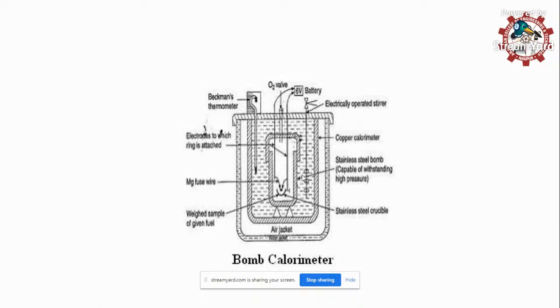See, here there's a question. Temperature is also dependent on pressure if it's not being placed under high temperature. We are using only 0.5 to 1 gram of coal sample. Yes? The coal sample is very small. The spark produced with the help of magnesium fuse wire is very much sufficient for burning. And here, 25 to 30 atmospheric pressure oxygen is also being used. So this much is okay for this experiment, right?